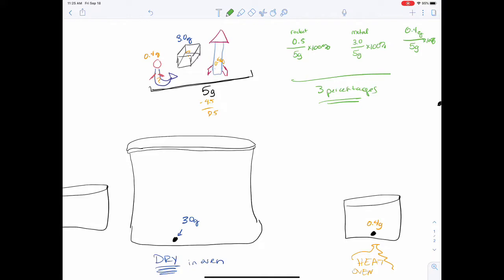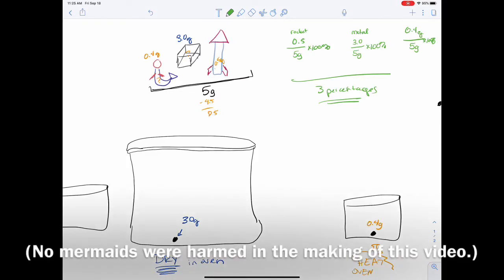And one last note, in this lab, the techniques that you're seeing are very common chemistry techniques. If you ever work in a lab, you will find yourself having to separate different compounds because most chemical reactions aren't neat and clean, only giving one product. There are more ways to separate compounds, but these are some of the most common that are used in labs everywhere. You'll definitely get more opportunities to separate mixtures when you take organic chemistry next year.